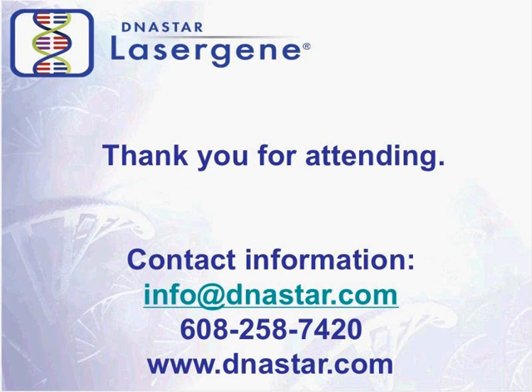Let's keep pushing on. Ian, this came for you. What method would you suggest to assess the quality of a de novo assembly of a metagenome? N50 is bad, I know, but what other measures are there? Information entropy, perhaps?